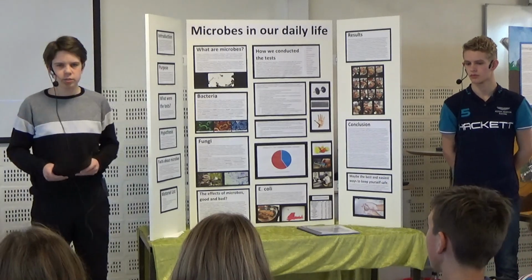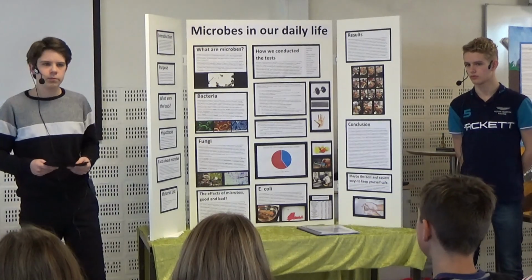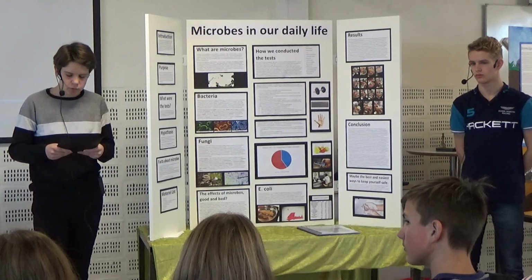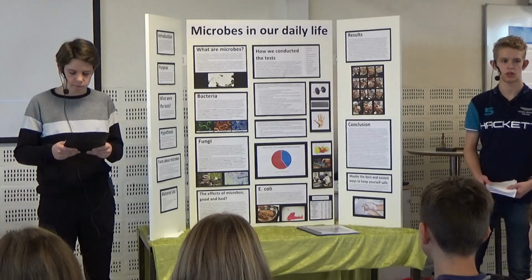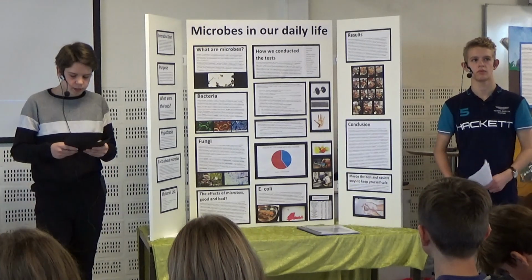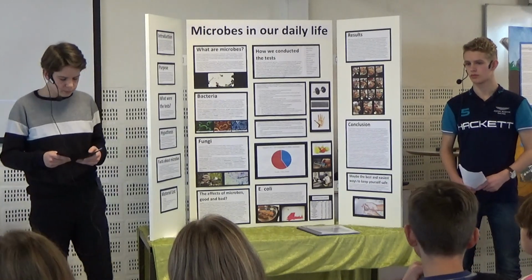The other 2 samples didn't show the same result. The free weights aren't usually clean and therefore they can be very contaminated, being the one with the 3rd most colonies on it. The treadmill wasn't clean either. We also sampled the treadmill on some of the places that you might not think of cleaning. But from the sample we can conclude that it really helps to clean the machines after use.